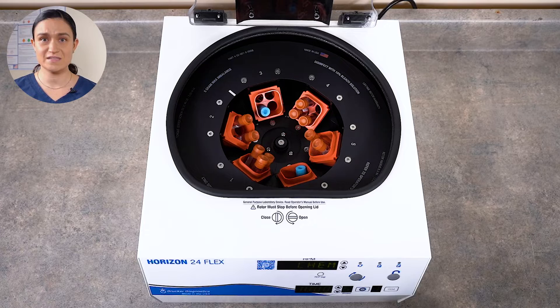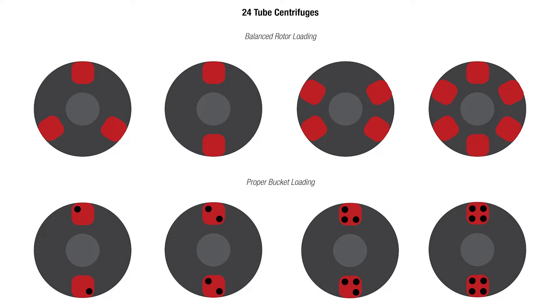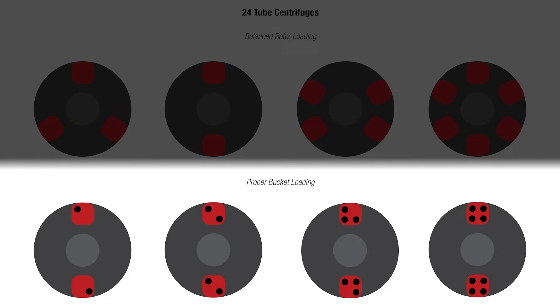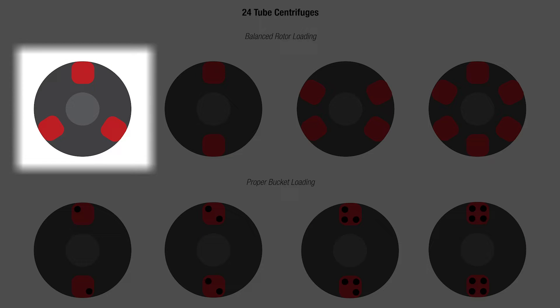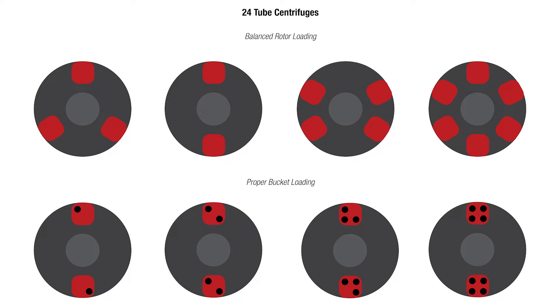Once you've got your tube holders placed, it's time to balance the tubes within those holders. For this part, think of each tube holder and the one across from it as a pair. The tube loading within this pair must be balanced. If you have one, two, or three tubes loaded, refer to the diagram on your screen for the appropriate loading. If you've got four tubes loaded, you're all set. If you've got three tube holders in place, you'll need to have either two or four tubes in each — there's no way to get symmetry with one tube or three tubes. You can redistribute your tubes into a fourth bucket, or use a counterbalance tube or two or three to hit that two or four per bucket fill.